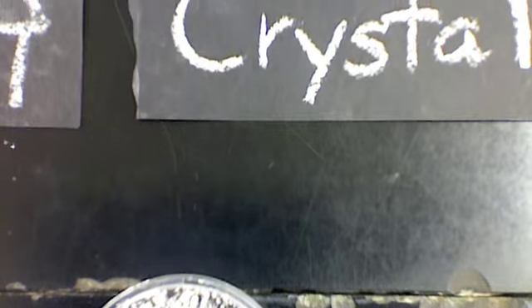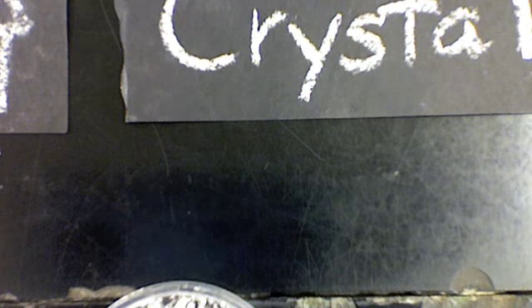And through the magic of Science Land, we have here an evaporation dish that has salt crystals in it. Now, while Miss Stilfen's getting the camera there, I just want to point out that the scientific name for salt is sodium chloride.